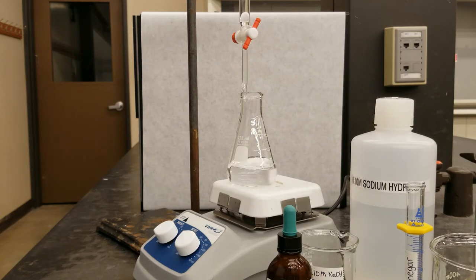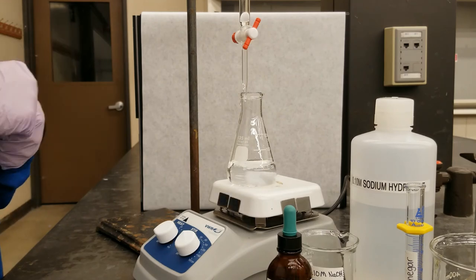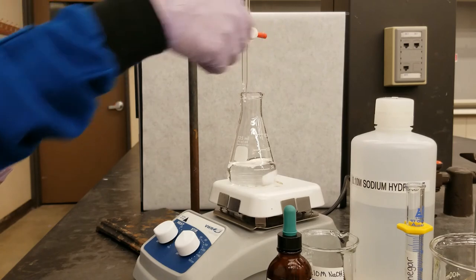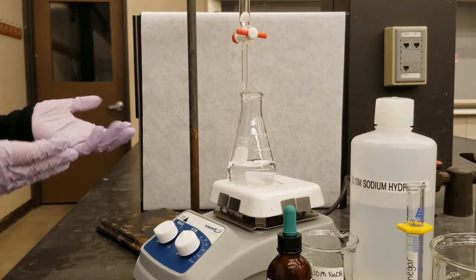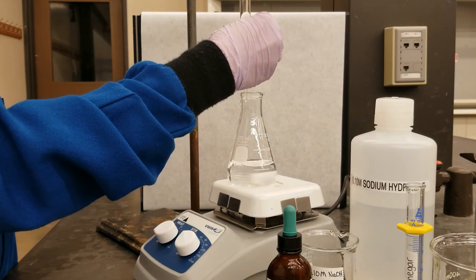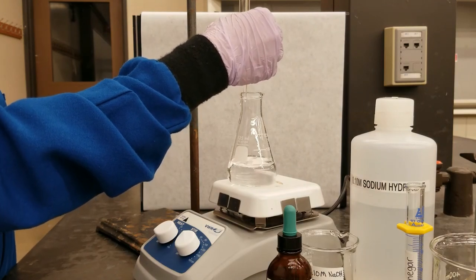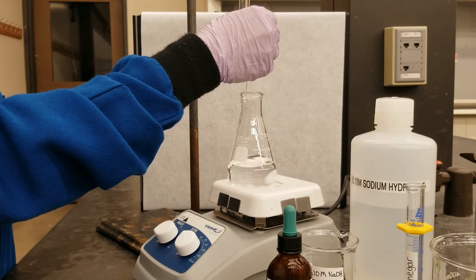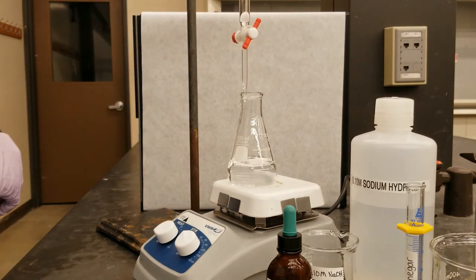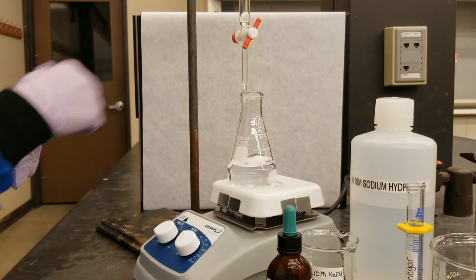So we're doing a second trial to make sure that our initial trial is accurate and that we've considered any possible errors that might have come about in our first trial. And I've started to slow down the amount of sodium hydroxide that's coming down because I'm seeing the pink color become more persistent.